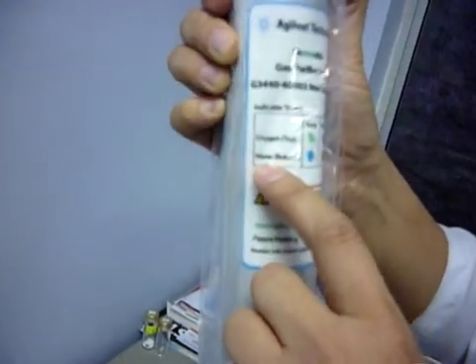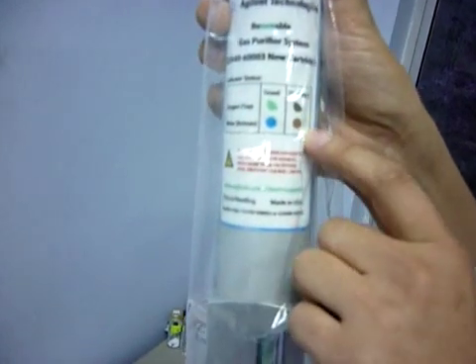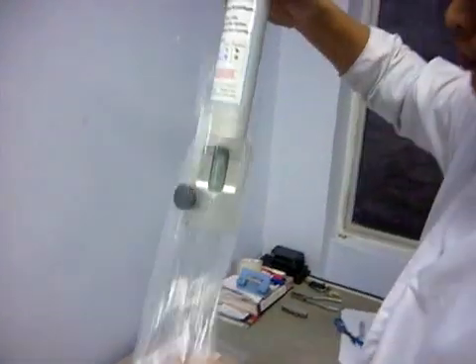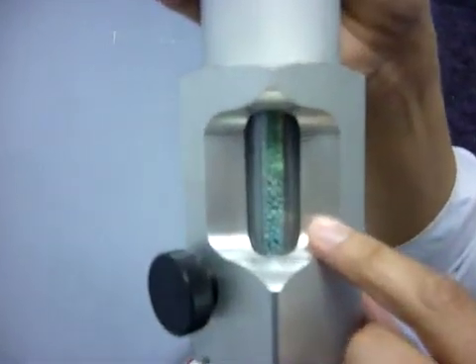G34406003 new cartridge. It shows that for oxygen, if it's green color, it's good. For water, if it's blue color, it's good. But when both of them turn to gray and brownish color, it's depleted already, so we need to change the cartridge. That's the color indicator.